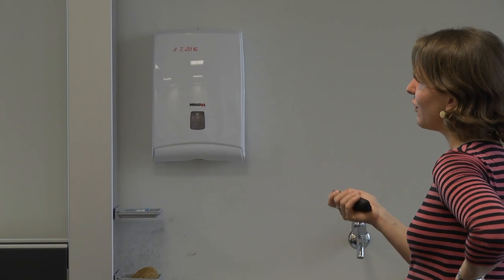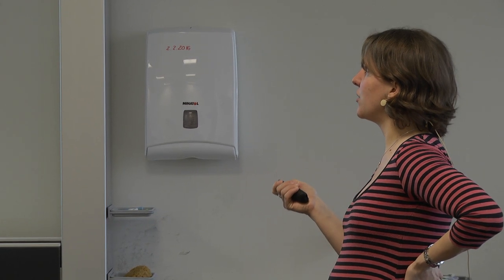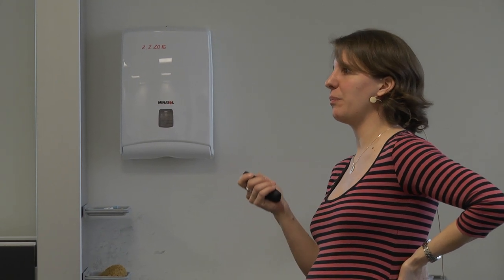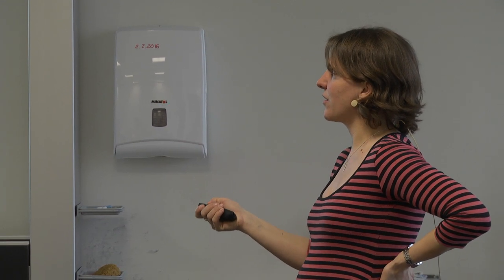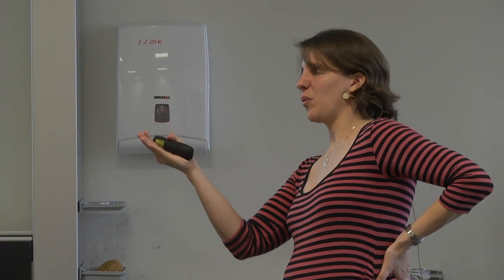That's one way of doing label-based quantification. You take a synthetic peptide and you spike in the same amount in both samples that you're looking at. It doesn't matter so much what the concentration is. It just needs to be the same. The other option is to work with an isotope completely labeled background proteome. It doesn't necessarily need to be a synthetic peptide.